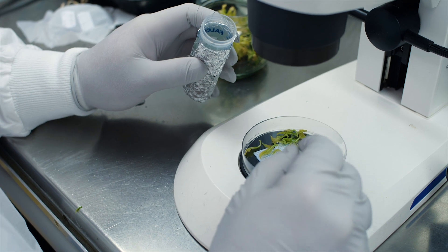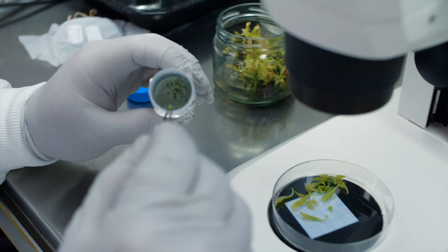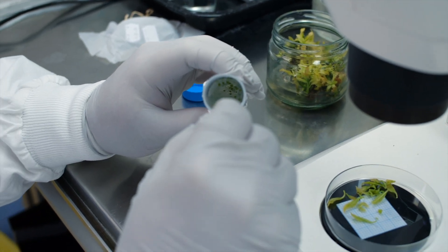Currently this germplasm is kept in field repositories throughout the world, but they're susceptible to abiotic and biotic diseases as well as environmental factors like storms, cyclones, and pandemics. So we want to create a frozen storage of Persea germplasm.